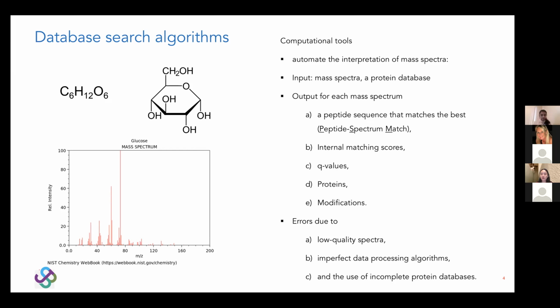Because peptide spectrum matching is an indispensable intermediate step for downstream analysis, it's very important to ensure the quality of this step. So we rely on a very popular statistical criterion, FDR, to help us ensure the quality of this step. Our goal is to do FDR control at this step.